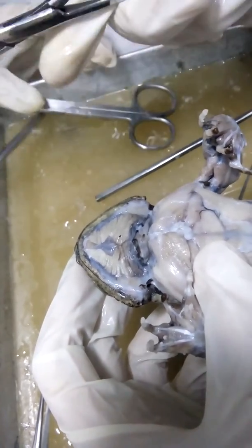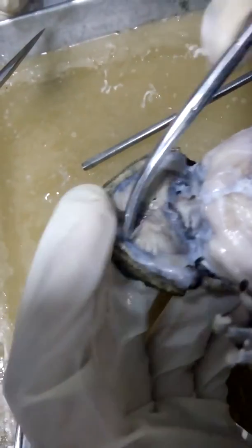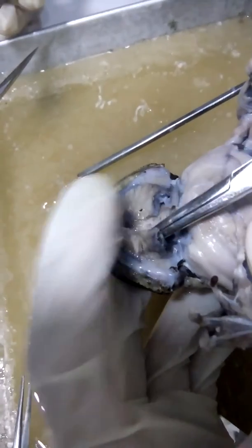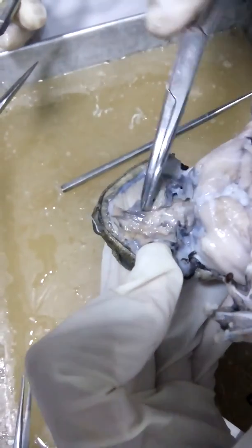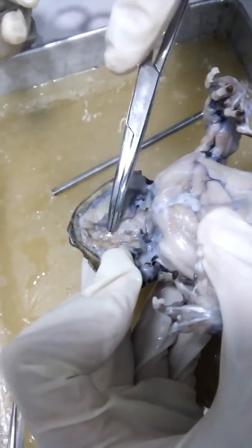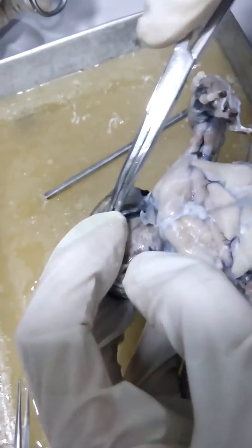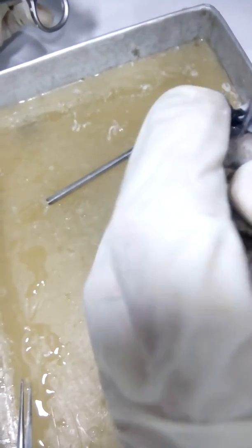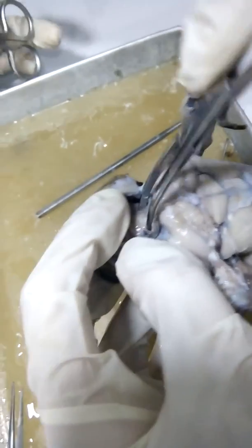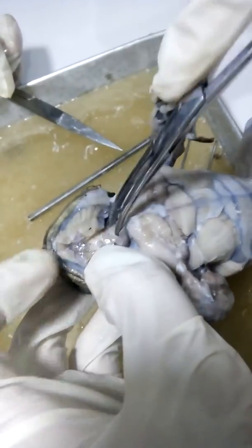And then if we, let me borrow this. If we cut in the middle and then open it, we can see inside it is the vertically nga stranded nga muscles, your geniohyoid. Yes. So pwede na nimo siya mabali. This right here would be your hyoglossus. So we'll open that later.